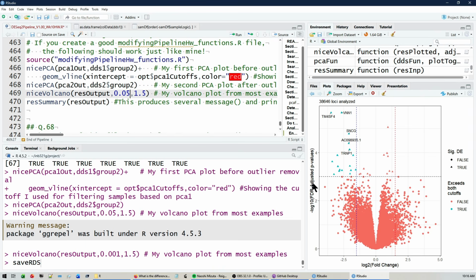That helps to adjust for the multiple experiments, since each of these different genes represents an independent-ish sampling of a distribution. The 1.5 here is my log2 fold change cutoff. That one actually is pretty arbitrary, but again, you shouldn't base things on simply what makes a pretty plot. You should base it on the norm for the field. And the norm for a lot of these fields is somewhere between 1 and 2 and maybe even up to 2.5. I've cut the middle here.